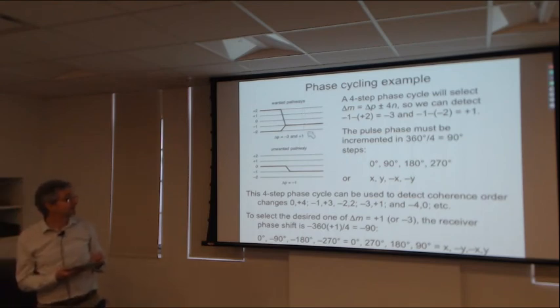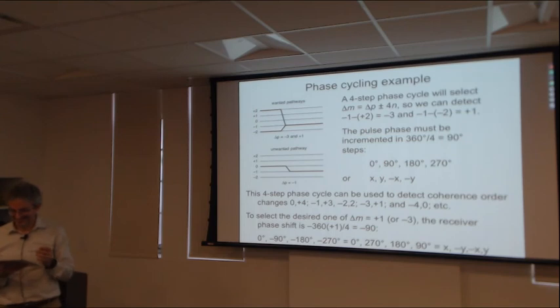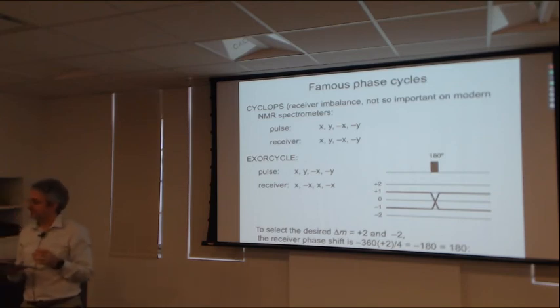The shortest general phase cycles, without knowing the fine detail of a particular experiment, are what's called cogwheel phase cycling by Malcolm Levitt, which is so elegant that I think it's hardly applied in practice. And they're kind of long, basically. You don't need to do this. So here I'll just tell you 2 famous phase cycles, and then we'll end.